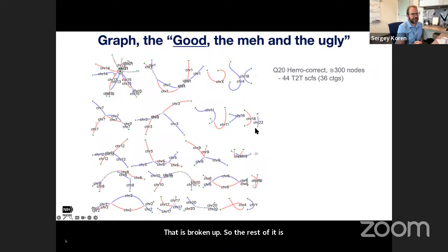So we would need to find what happened to the rest of this chromosome 22. Right, and this is an acrocentric, so it should have attached to this rDNA cluster. And these are the acrocentrics. This is why they're difficult to resolve that I mentioned.